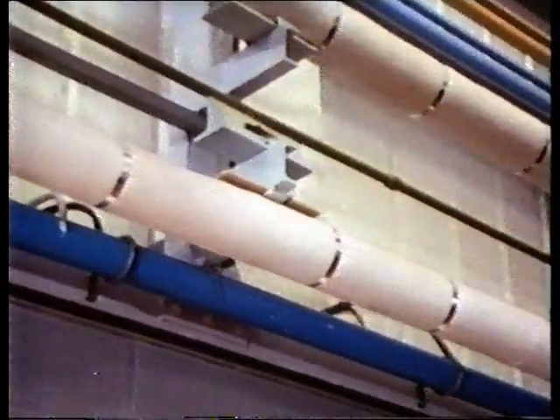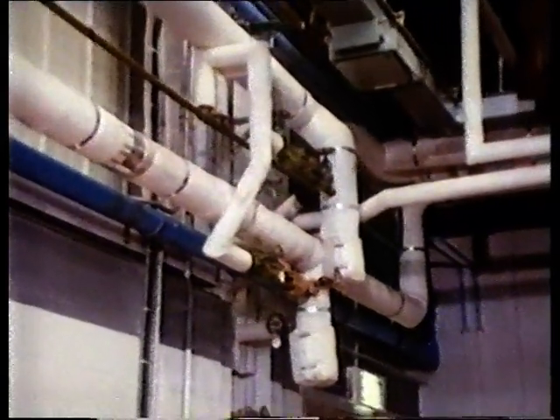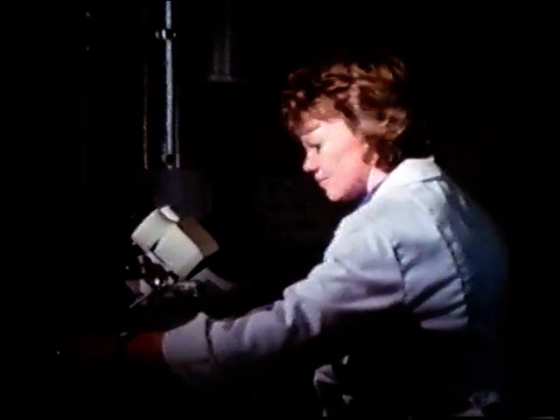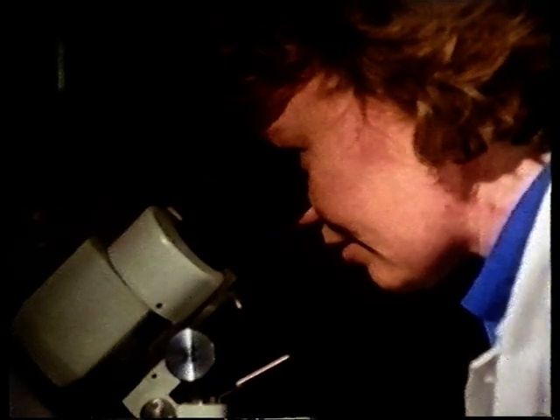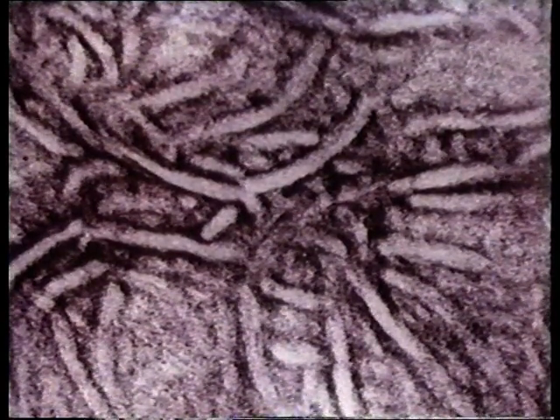You can see some actually in use here in one of the BP Chemicals development laboratories. It's lightweight, strong, and doesn't corrode easily. An electron microscopist at Grangemouth examines a polyethene sample in the electron microscope. Those worm-like shapes are polyethene crystals. Each contains long folded carbon chains of the polymer.